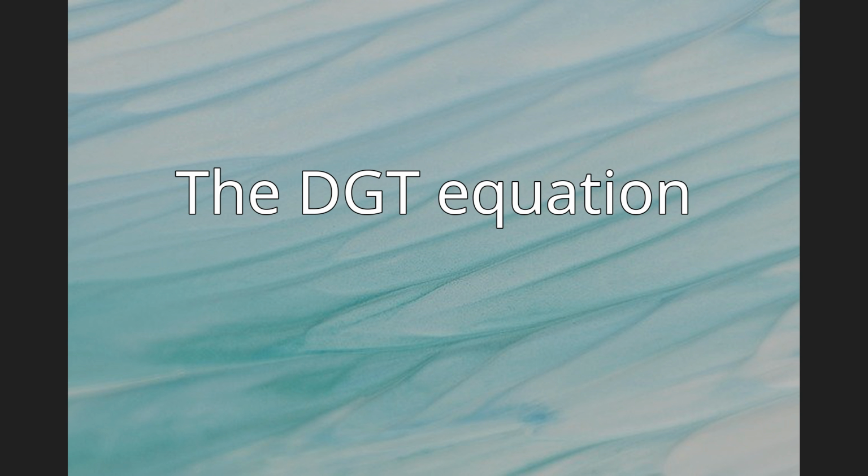C_DGT = (M Δg) / (D t A), where M is the mass of the analyte on the resin.